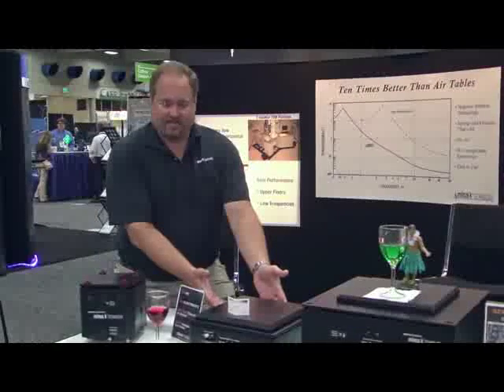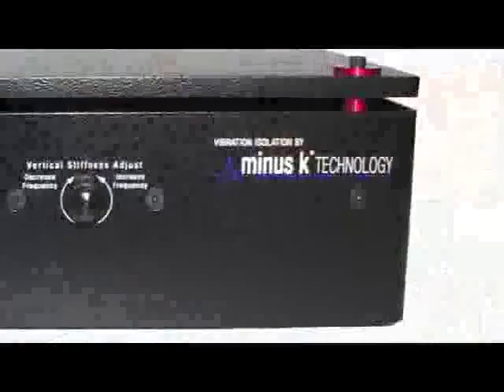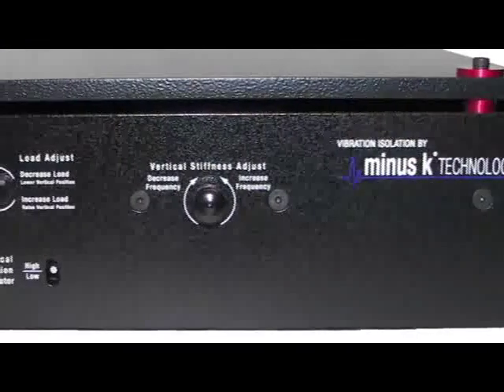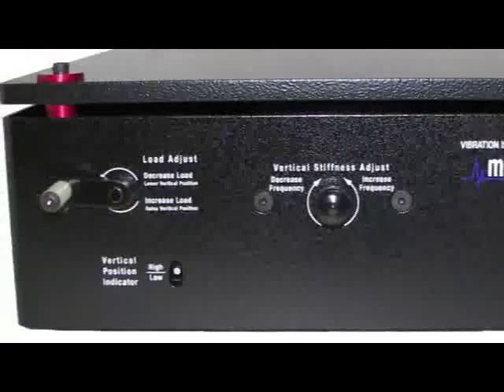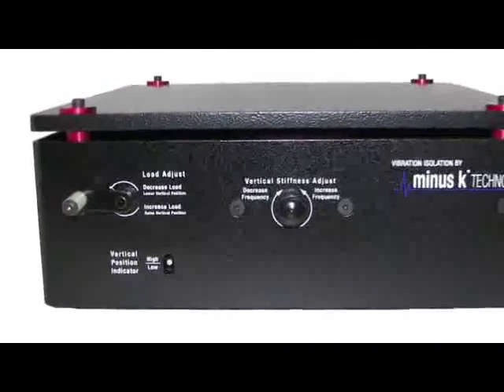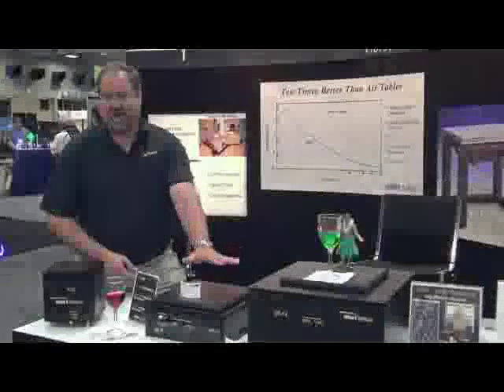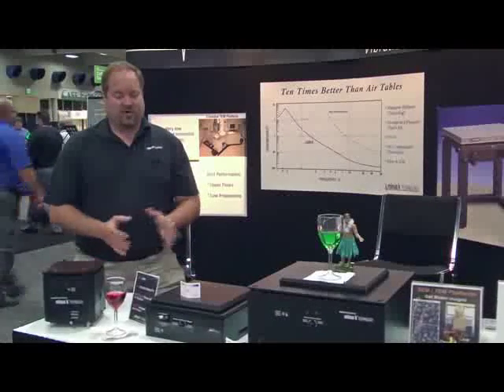This is our BM-10. This isolator is really aimed at small atomic force microscopes and other small instruments that really want to have incredibly high levels of vibrational isolation, but you don't have a lot of room. This offers one and a half hertz horizontal, and we deliver our signature half hertz performance vertically. So it's perfect for things like that.